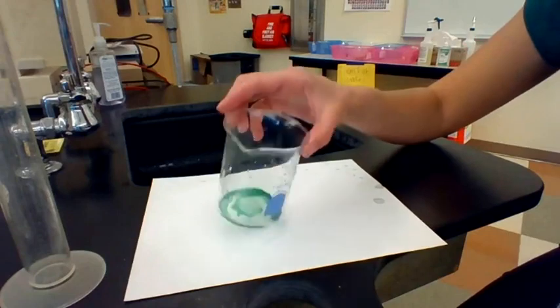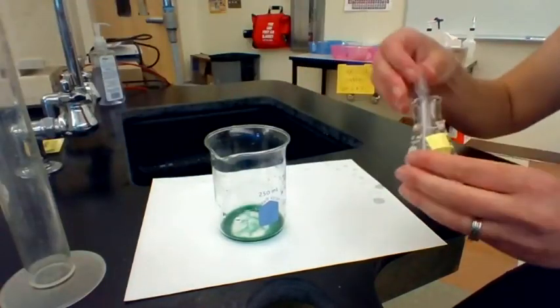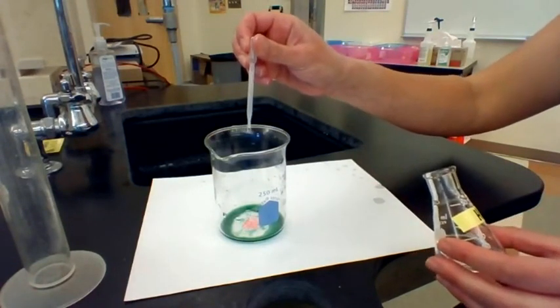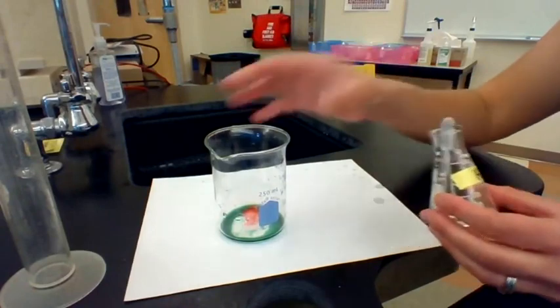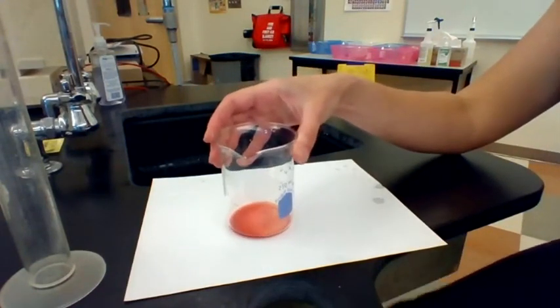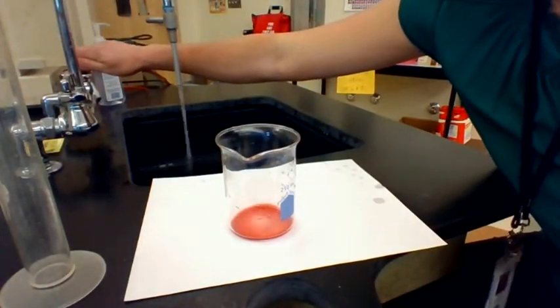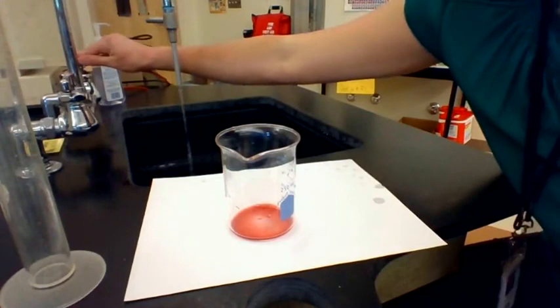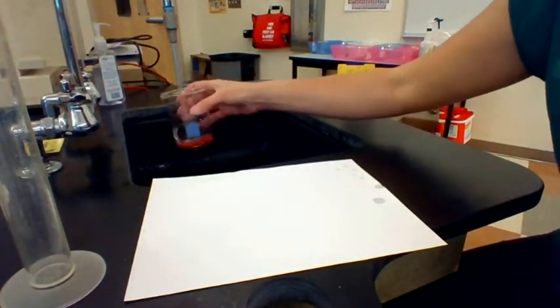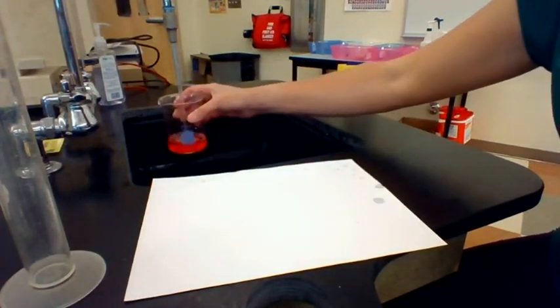All right, so here I have a beaker that's already got some universal indicator in it. And I'm going to start out by adding 6 drops of HCl. Here we go. We swirl that around. It turns bright red. So this is very acidic, okay? And what we're going to try and do is add some water slowly and see how much water it takes to change the pH here. So we saw just adding a few drops of water doesn't change the pH.